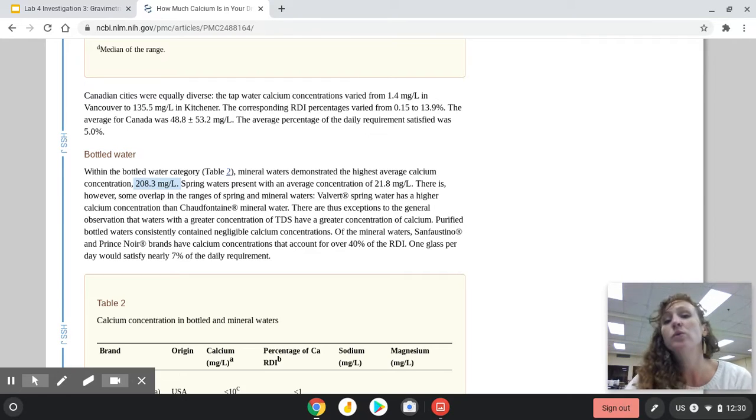Or you can do the 4 different trials and just do some guess and check and see when your results stop increasing. Either way, make sure you include it in your procedure. Also, you need a hazards and safety data table. Well, I guess the calcium's in tap water, so let's assume that's safe. So the only thing you need to look up is sodium carbonate. Okay, have fun.